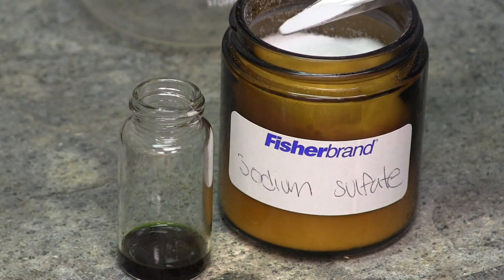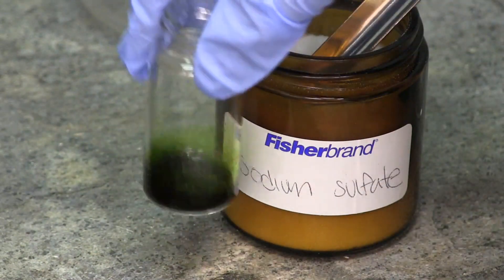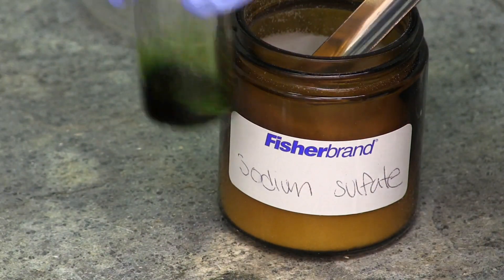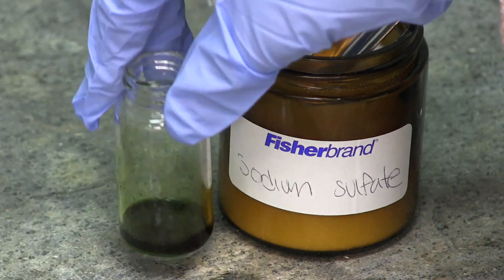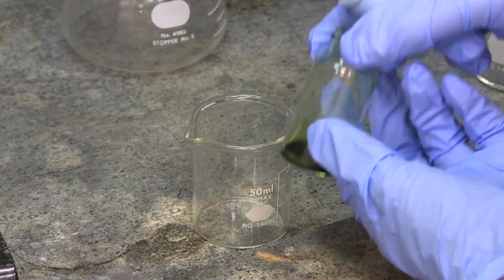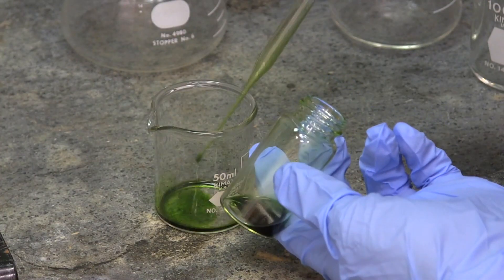The spinach sample is dried with anhydrous sodium sulfate. Not a lot of sodium sulfate is needed. The sample is dry when the sodium sulfate doesn't clump together when shaking the scintillation vial. A pipette is then used to remove the sample from the sodium sulfate into a small beaker.